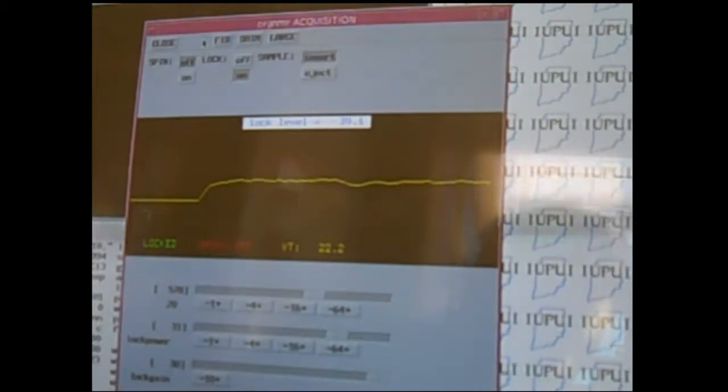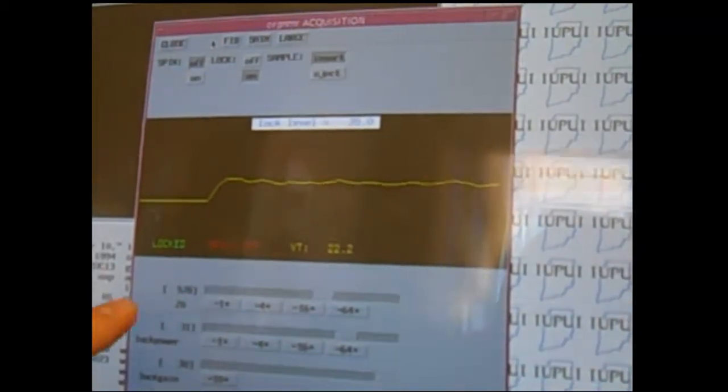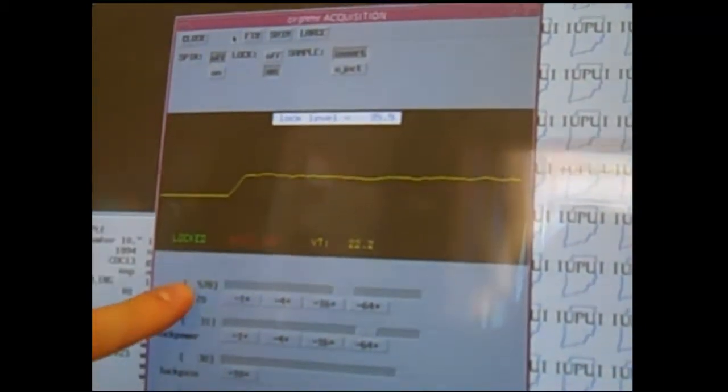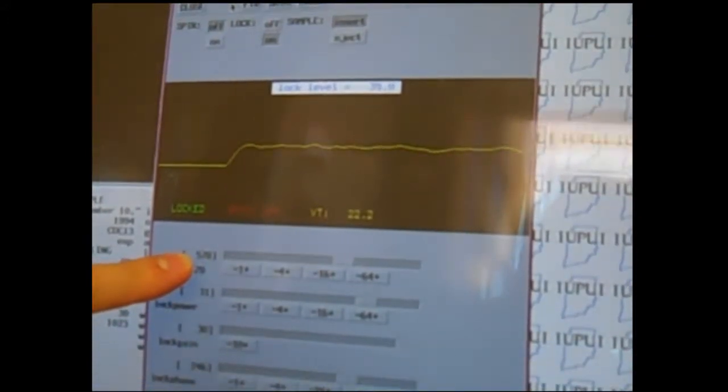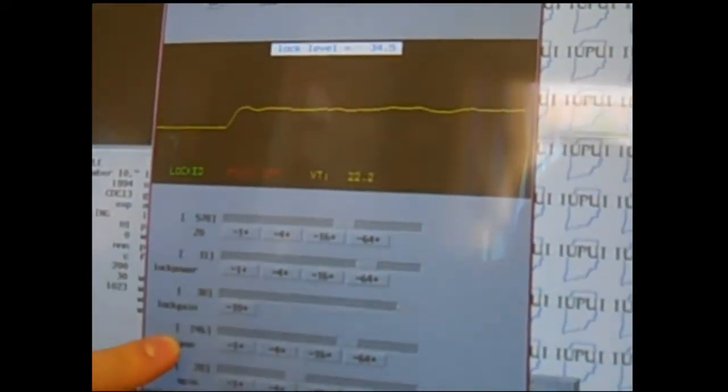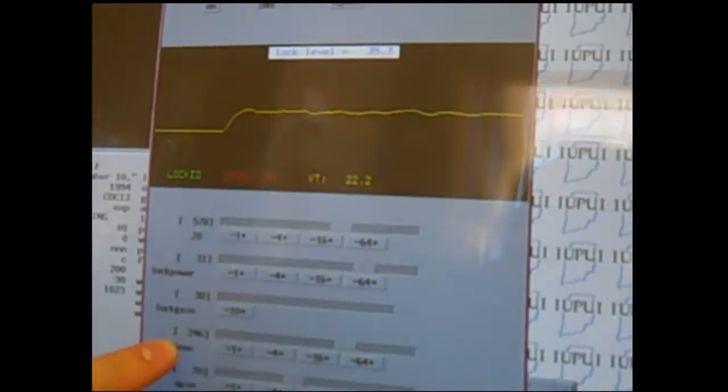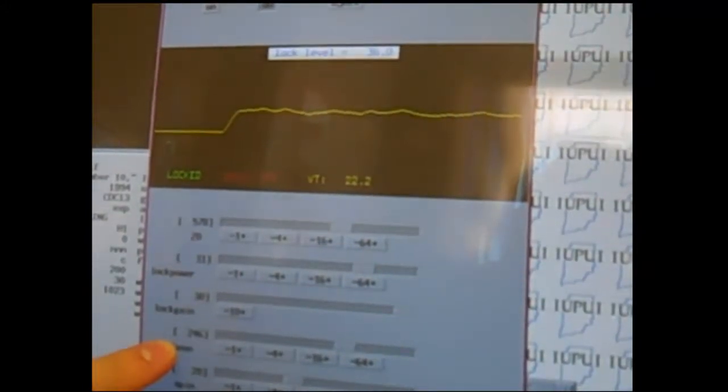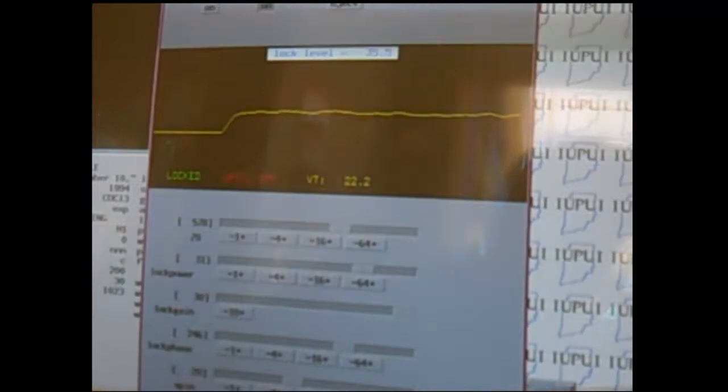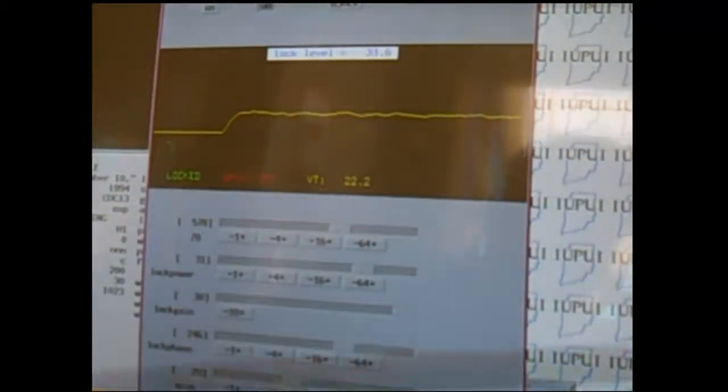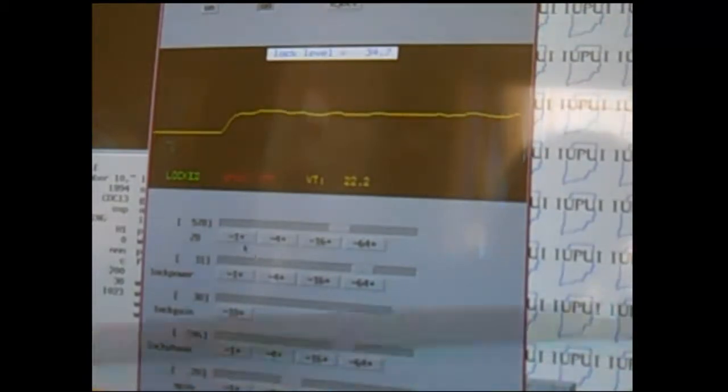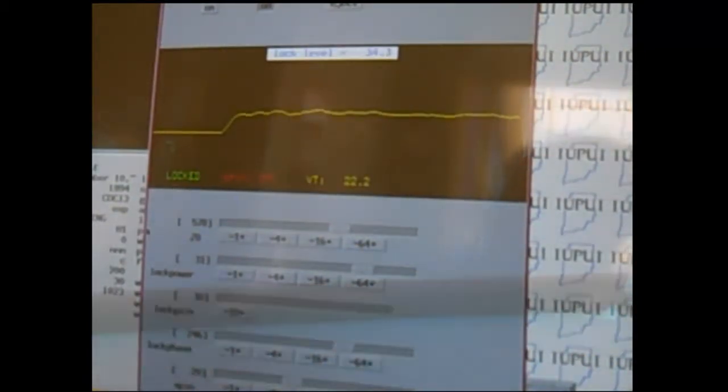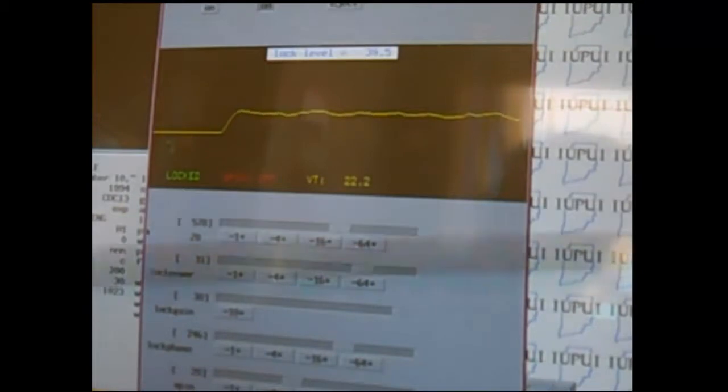One thing you want to make sure is that the values on this screen, the Z0 and the lock phase, are what's written to the left of the computer by the instrument specialist. So initially these values, if they're set appropriately, you should not have to adjust.